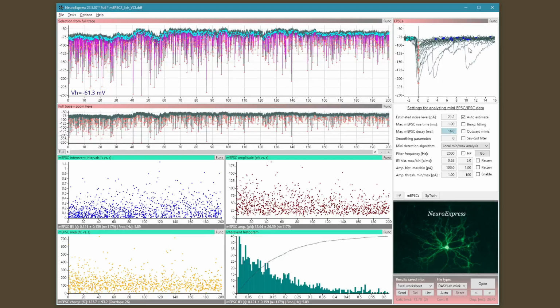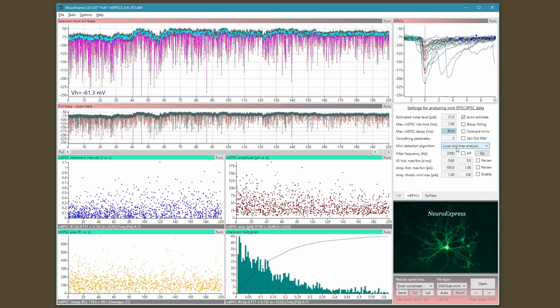And basically you would like to see something like here, that all the termination points, these blue colored symbols, are within the plot, but maybe they should be somewhere at the end of this panel, like here. So this will show that most of these events are fully grown and decayed before the end of this panel.